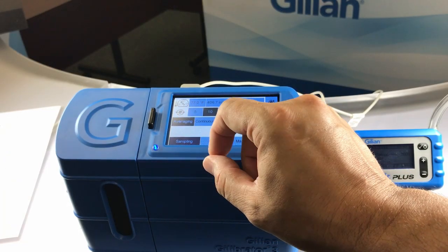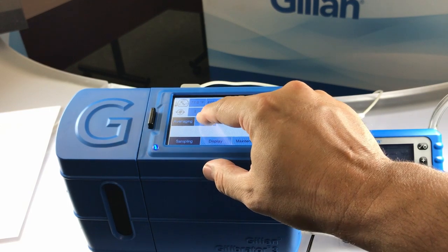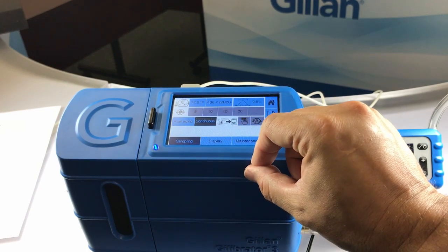In averaging mode, data is only sent after all the samples have been acquired. However, in continuous mode, the data is sent after every sample.